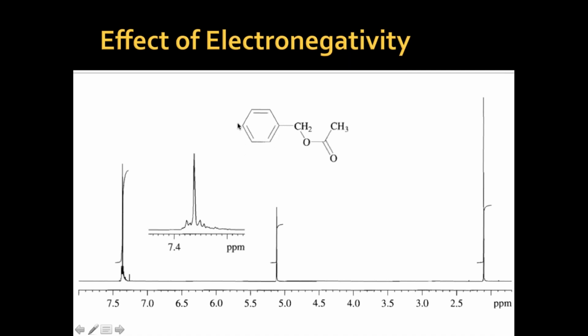What that means? All the protons are in influence with each other, and there is no other functional group present on the benzene ring. What that means? There is no different environment for the proton. Means they all show up approximately at the same place, right?